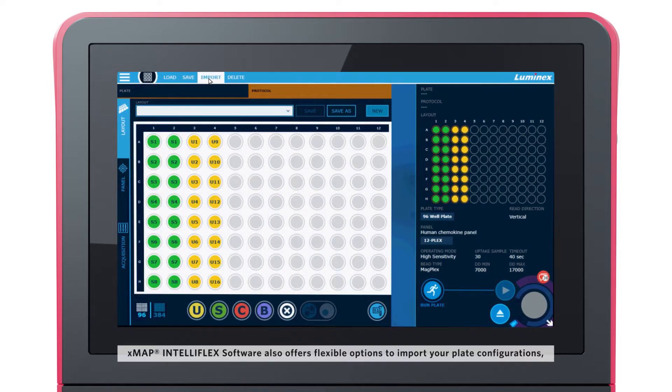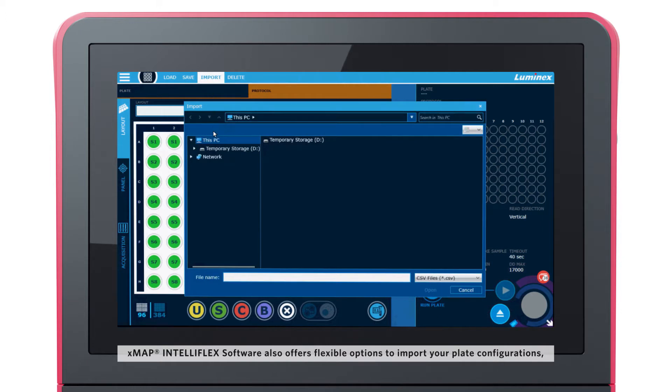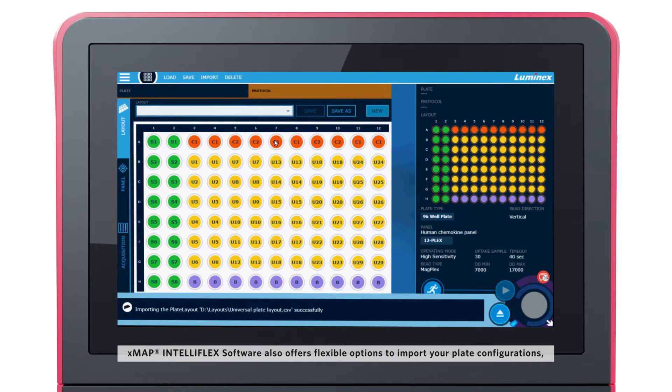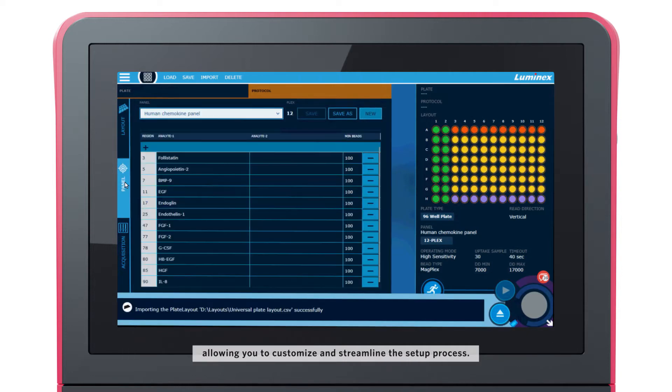XMAP and Teleflex software also offers flexible options to import your plate configurations, allowing you to customize and streamline the setup process.